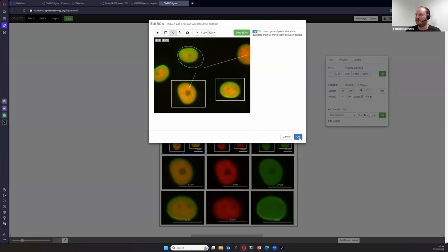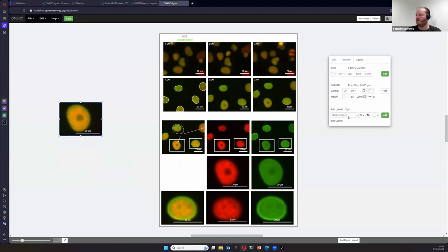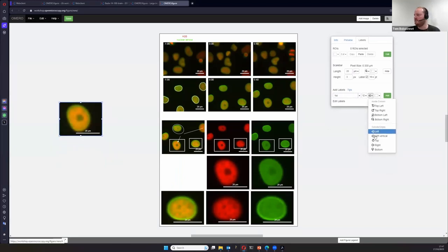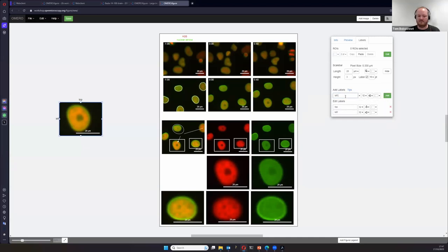Otherwise, you have labels that you can put in the corner of the image, on the top, around the image, on the top-left, or vertically. You can also use the formatting options to put text in bold or italic — for example, surrounding text with two stars makes it bold.